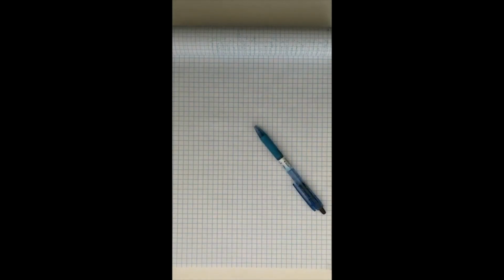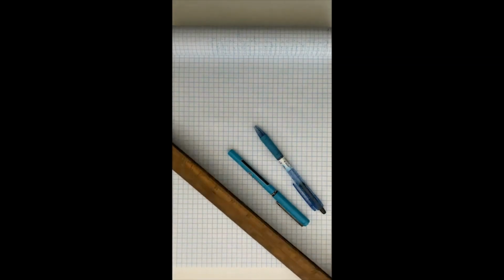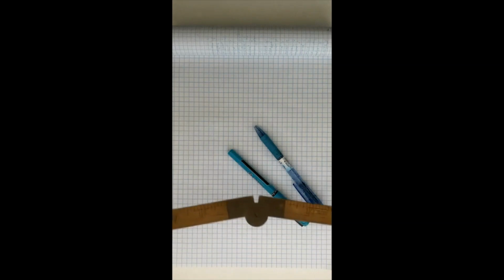To start with some materials, I've got my lab notebook. Graphing paper is really helpful for this, but not needed. I've got my pen. Again, we want things done in pen, and some instructors are picky about color. I personally don't care about it. The last thing I've got is a ruler because we want our work to be nice and neat. It straightens out to be a little bit longer, but that is our ruler there.